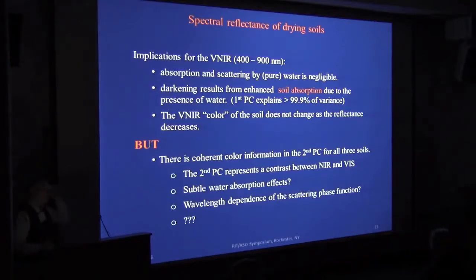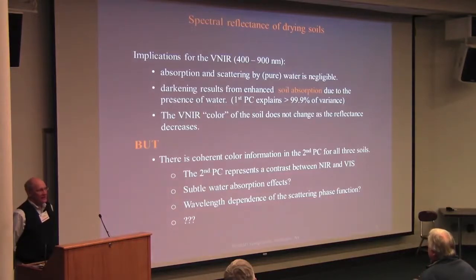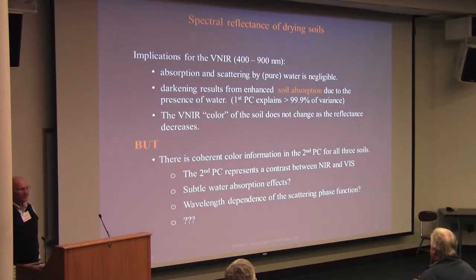Yes. Oh no, go ahead. You're fine. Well, the amount of scattering you get, you get scattered anytime there's an index of refraction change. And when you put water in there, you replace the air with water. Right. And the water doesn't have a constant index of refraction across the wavelength range. But if you look at the wavelength dependence of the index of refraction of water, it actually has a very similar shape to your second PC. So I'm wondering if you might have something there.